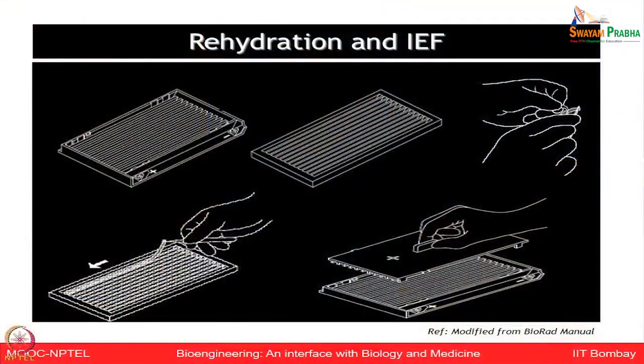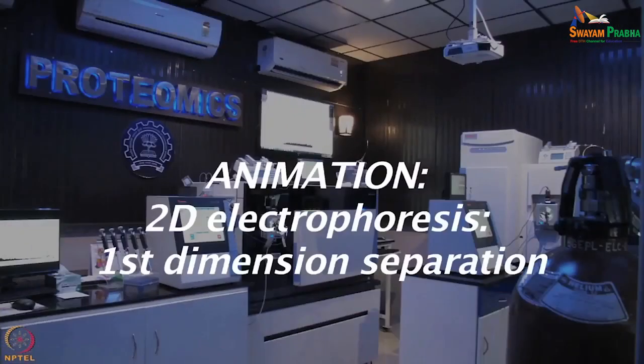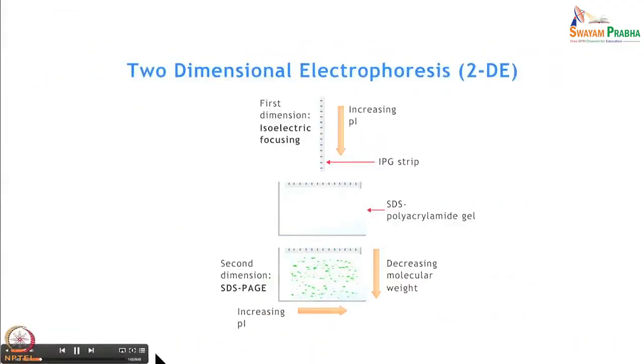Then after you have put your protein solution and added the IPG strip, you cover it with some mineral oil so that the proteins do not solidify on the edges and it does not evaporate. Then you leave it overnight so that proteins slowly get absorbed in the IPG strip, and the next day, when you want to start your first dimension separation, you are ready to do the isoelectric focusing. Let us also see some of these details of rehydration and IEF in animation form.